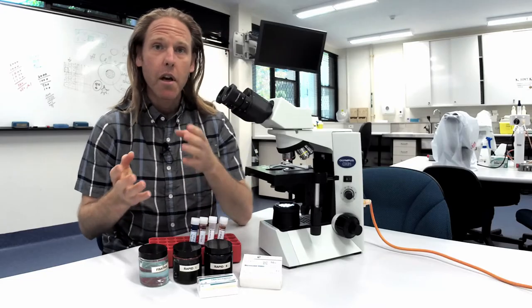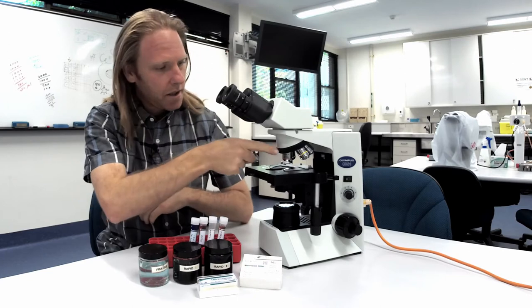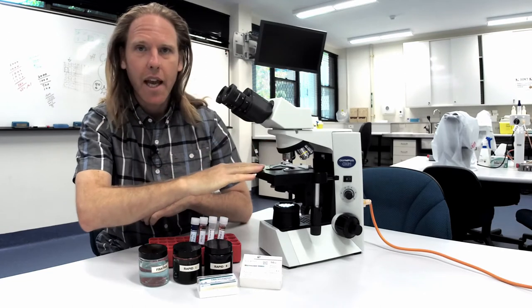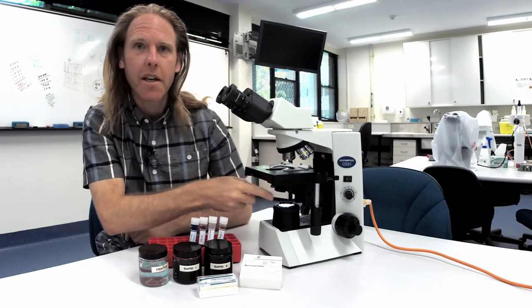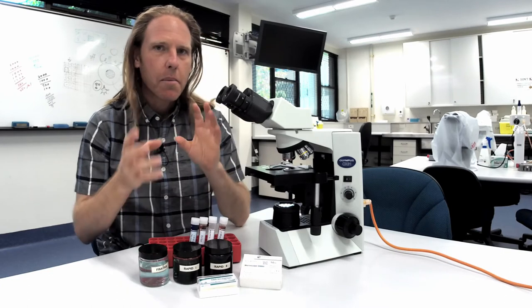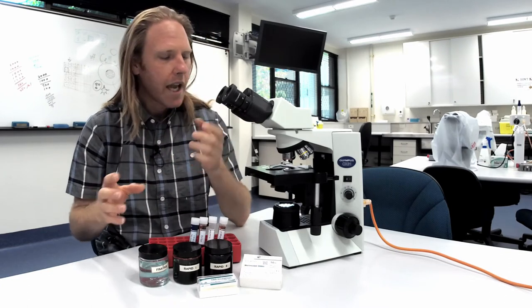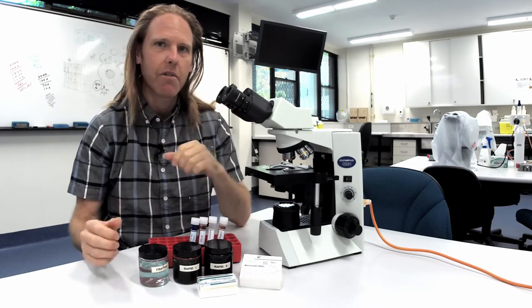With your microscope the basics of any scope are the eyepieces, objective lenses, the stage and the condenser and aperture. Now each of these needs to be adjusted to get the most out of your image and each of these parts needs to be cleaned regularly and often.